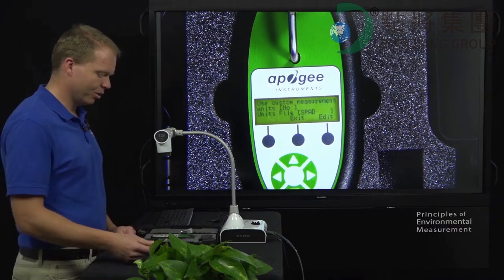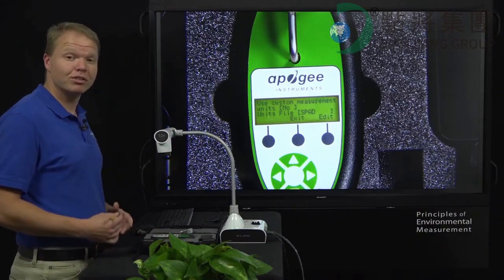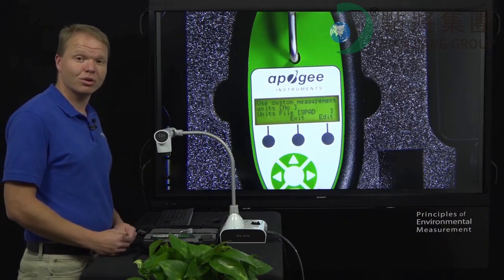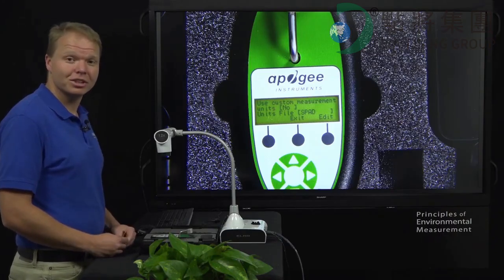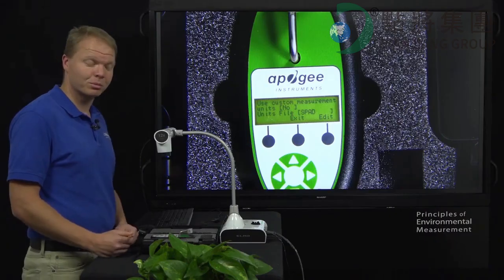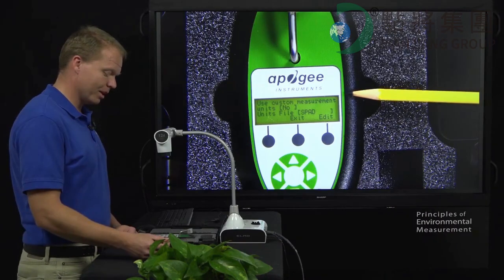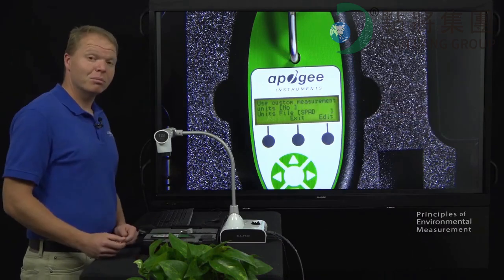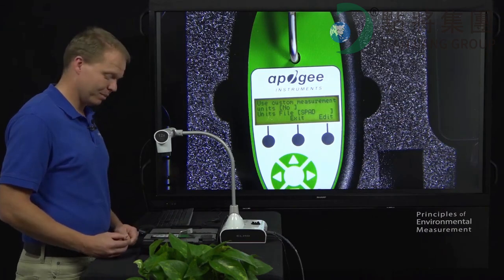Next, use custom measurements. So what it's asking us here is what is the unit that we want to read our chlorophyll in. We talked about we have CCI units, we have SPAD units, and then we have units of chlorophyll in terms of micromoles per meter squared. So when it says use custom measurement, it says no right now. That saying no means it is in CCI units.